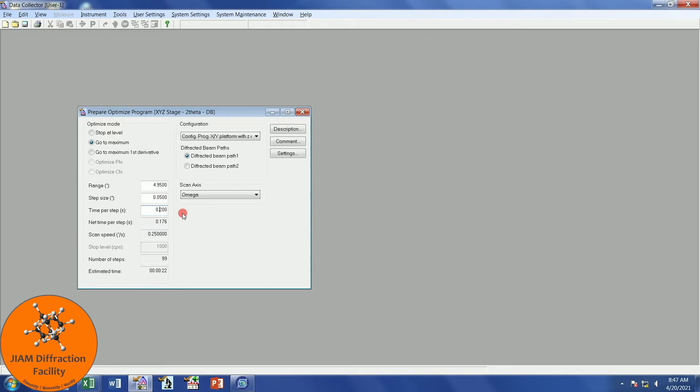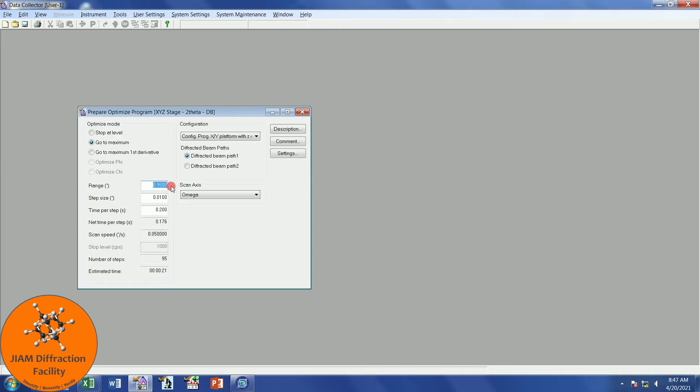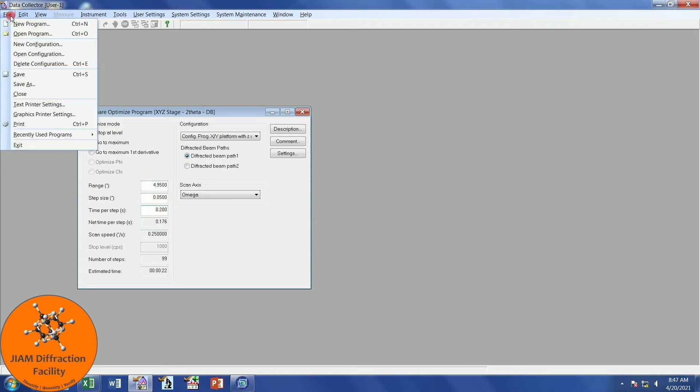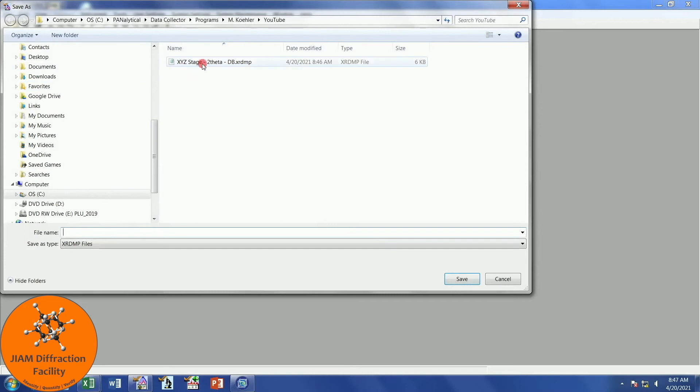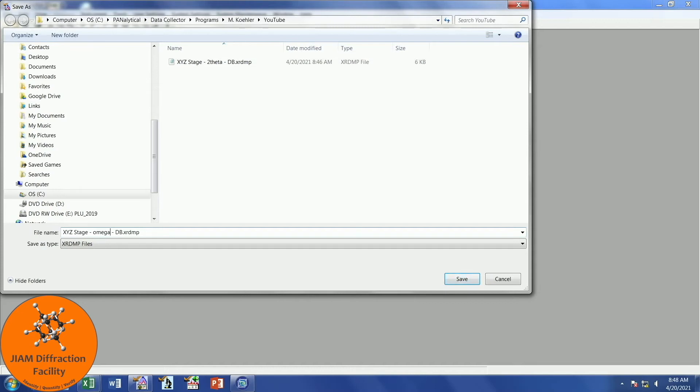If you predominantly run the same type of samples, such as thin films on a substrate of some sort, and they always have very sharp peaks that are close to 0, you may want to change the range to something like 1, and the step size to 0.01. For my purposes, because we handle a lot of different types of samples, I'm going to leave this at 5 and 0.05. We can now save this. I'll left-click here once and change this to Omega. Save.